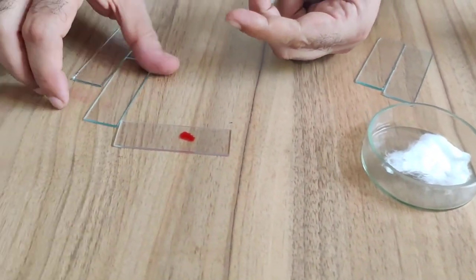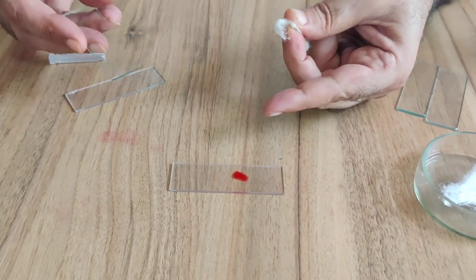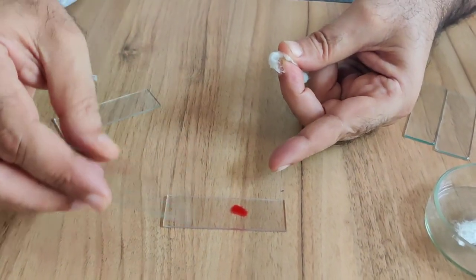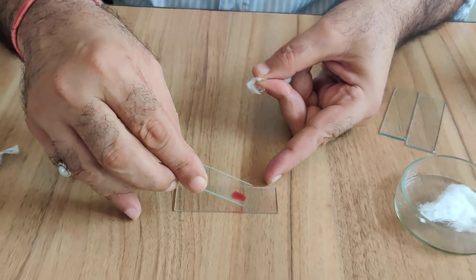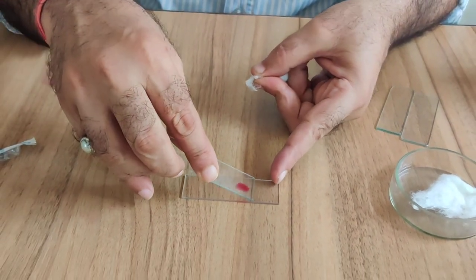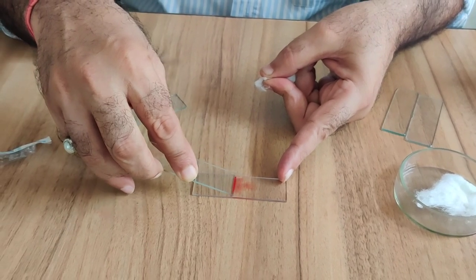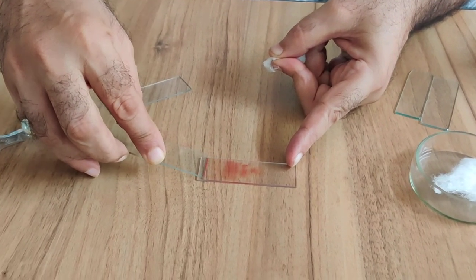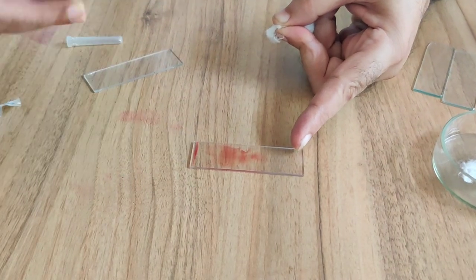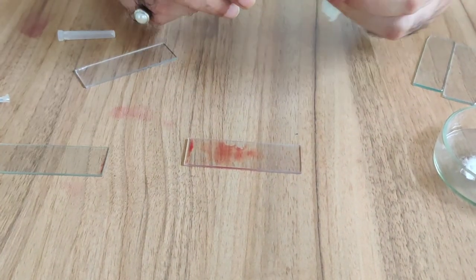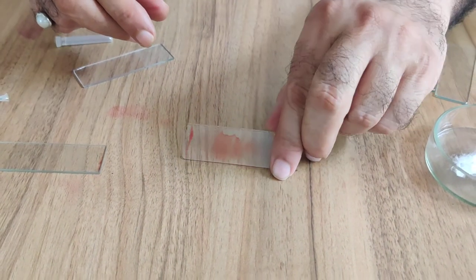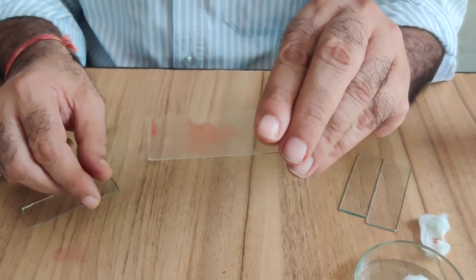Now this blood drop on the slide, take another slide, clean slide, and make a specific angle of 45 degrees and spread the blood film over the slide. In this way you will be able to get a thin layer of blood on a slide.